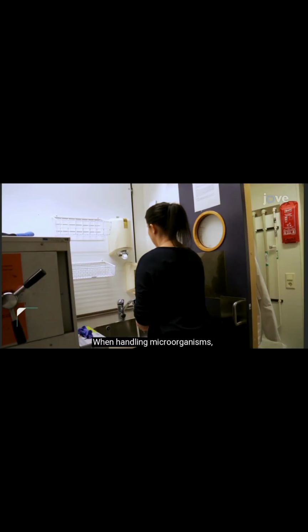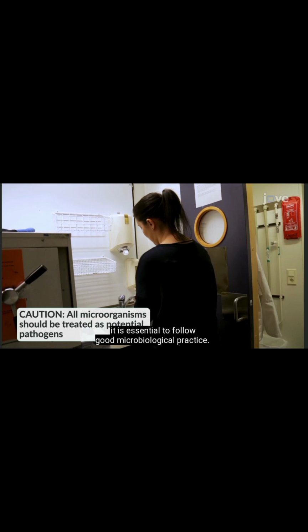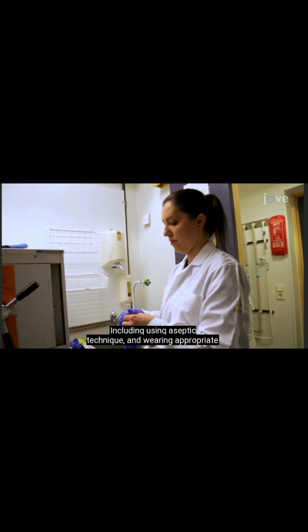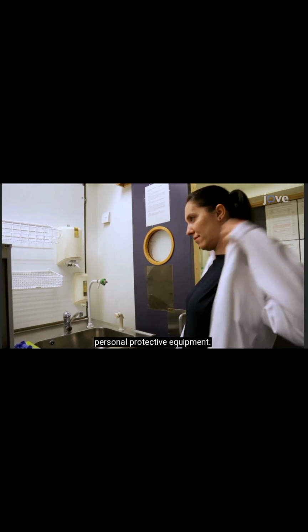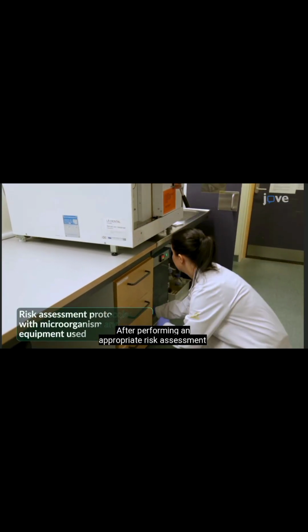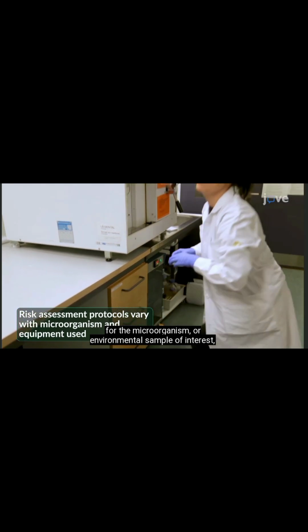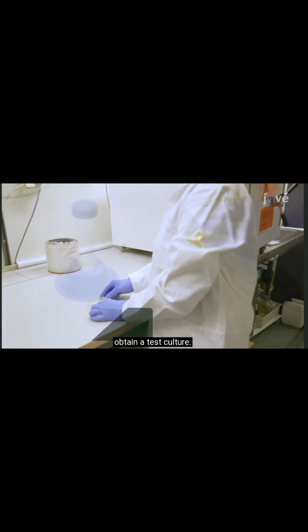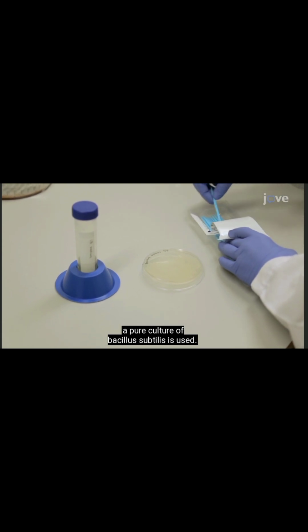When handling microorganisms, it is essential to follow good microbiological practice, including using aseptic technique and wearing appropriate personal protective equipment. After performing an appropriate risk assessment for the microorganism or environmental sample of interest, obtain a test culture. In this example, a pure culture of Bacillus subtilis is used.